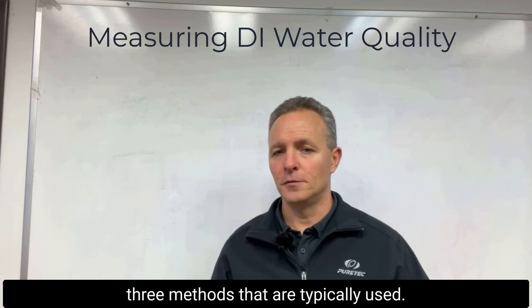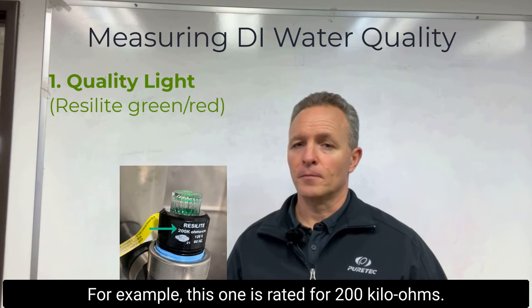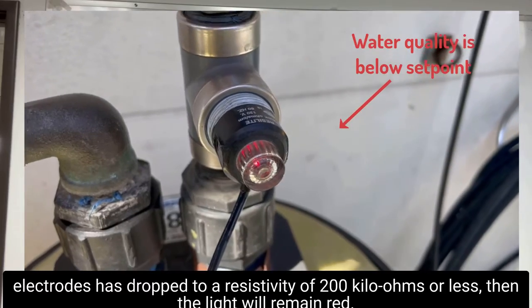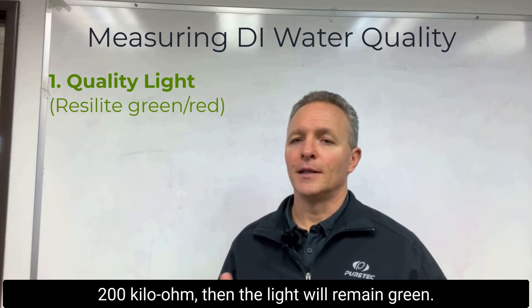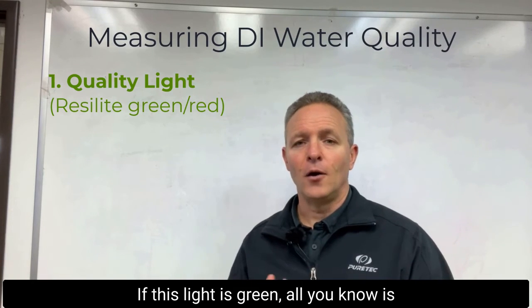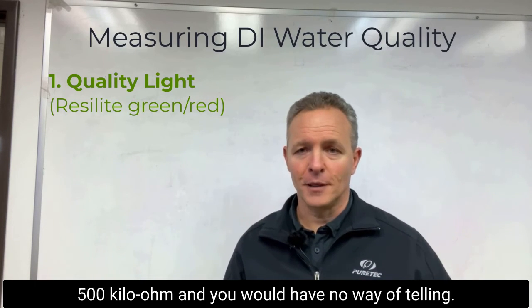With that in mind, there are three methods typically used. The first is a simple quality light — you can get them with different resistivity ratings. For example, this one is rated for 200 kilo ohms, which means that when the water passing through has dropped to a resistivity of 200 kilo ohms or less, the light will remain red. If the water has a resistivity greater than 200 kilo ohms, the light will remain green. The main drawback is it can't give you a specific resistivity value — if the light is green, all you know is that the water is above 200 kilo ohms; it could be 18 mega ohms, 1 mega ohm, or 500 kilo ohms, and you'd have no way of telling.